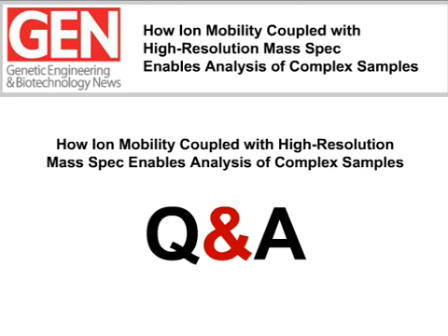Having said that, you can use the promotion of gas phase interactions like the polarizability of the gas. If you use an inert gas that's highly polarizable, you might see different separations than one that is less polarizable. There have also been some reports of people using gas additives to change the selectivity that one sees in the ion mobility, which I think is probably better described as a gas phase electrophoresis.